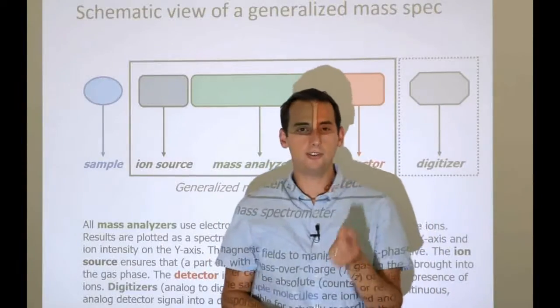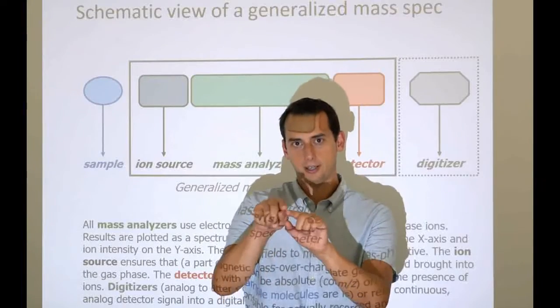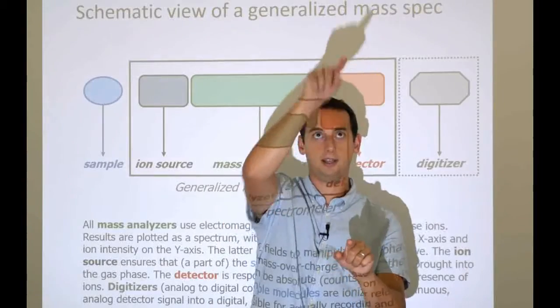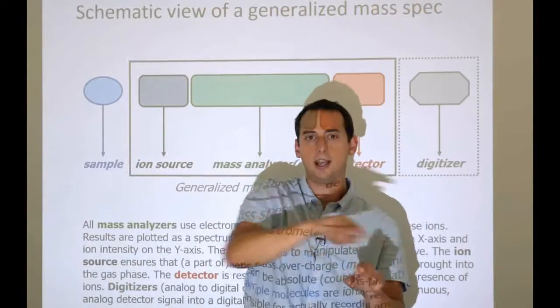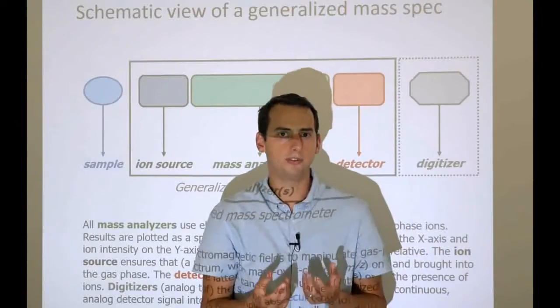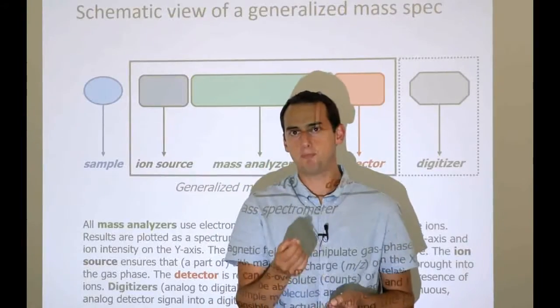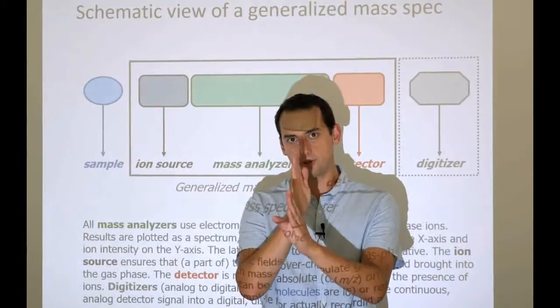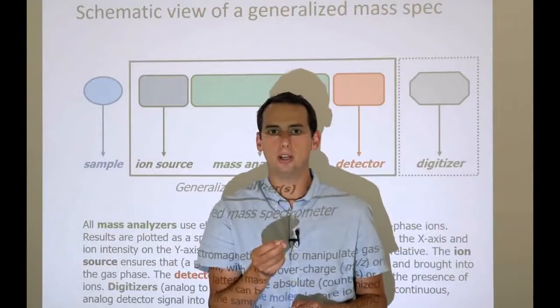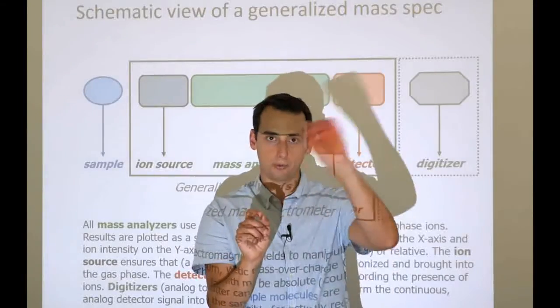If we had a digitizer that were faster, it would have been able to measure it here, here, here, here, and many more points, and we could have reconstituted the original signal. So in a way, what is important here is the speed of the digitizer, the speed with which it cuts continuous time into small intervals, is very important for resolution, how fine-grained a piece of structure you can pick up when you go through the signal.